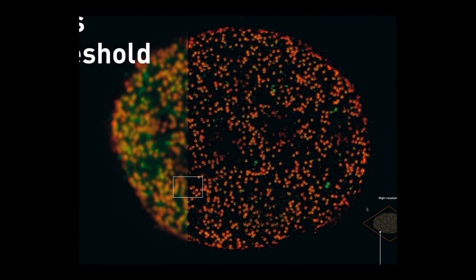I would like to show you this picture. On the left, you see a confocal image; on the right, the equivalent STED image. This is actually a nucleus — a nuclear pore staining in two colors — and it was acquired by one of our STED machines.